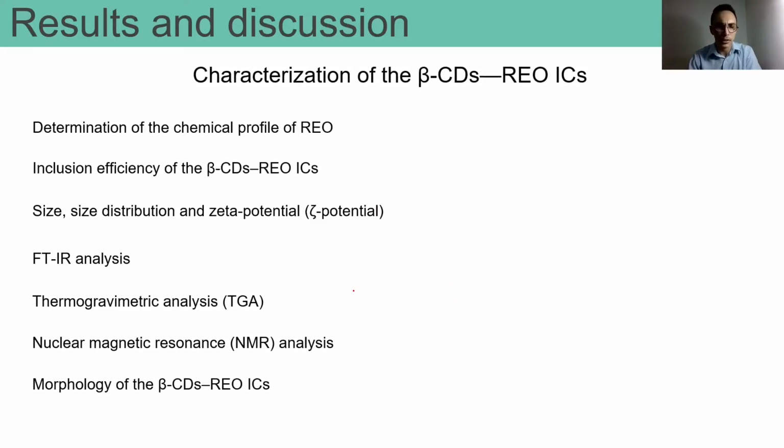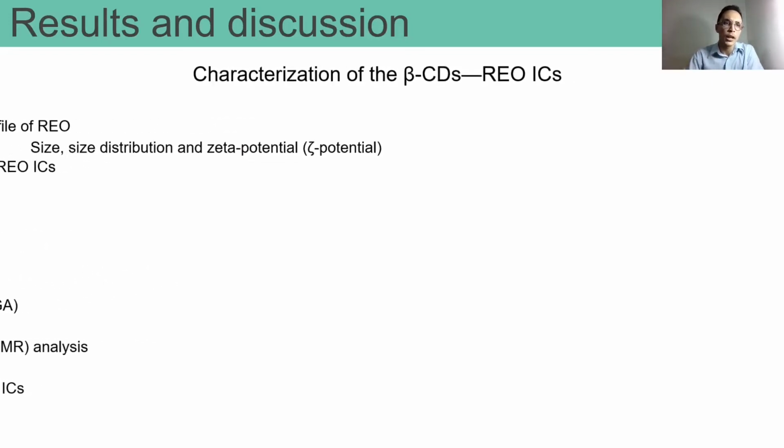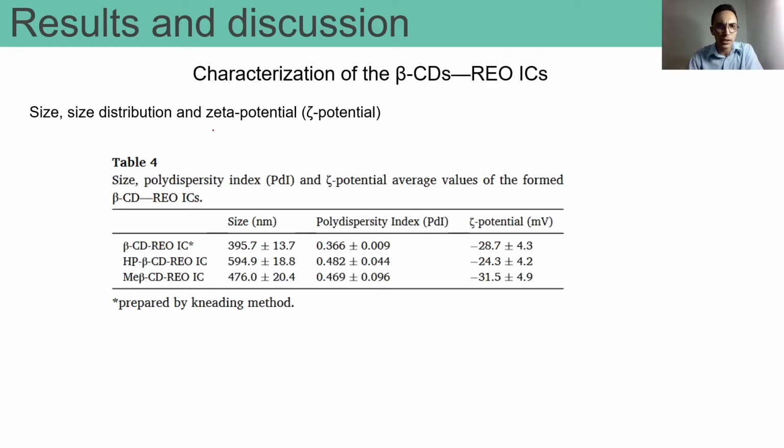The other point we're going to talk about, the third, is size distribution and zeta potential. Here we have some sizes that are different from each other because the molecules are so different.